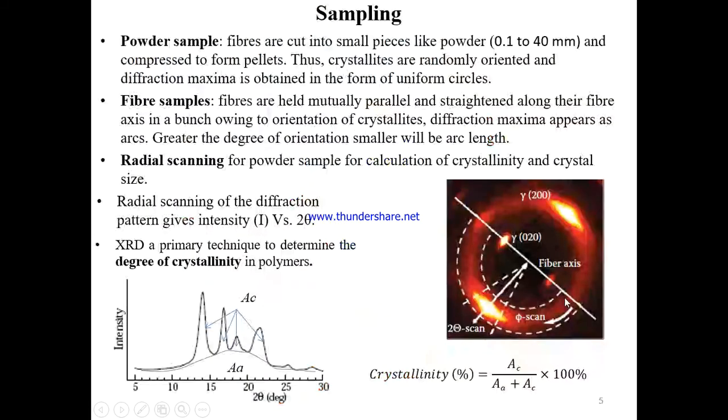You already know this, or you have also done some experiments in your physics laboratory with the diffraction spectra of different polymers. The diffraction spectrum typically looks like this, either on a photographic plate or in some camera. There will be a central maximum, and then a number of bright rings.